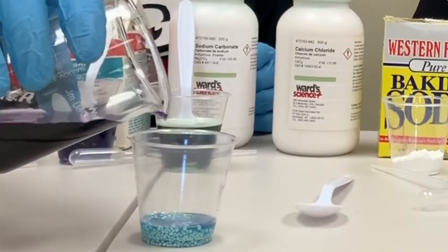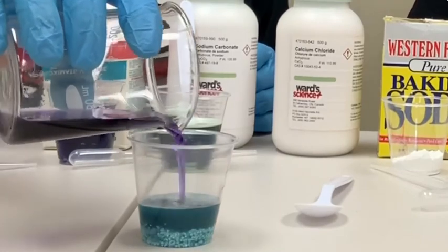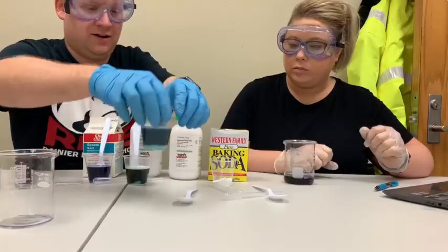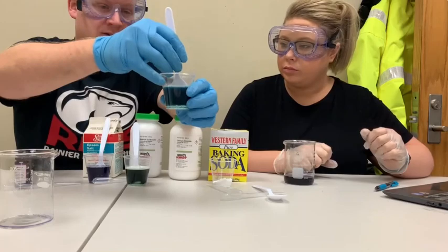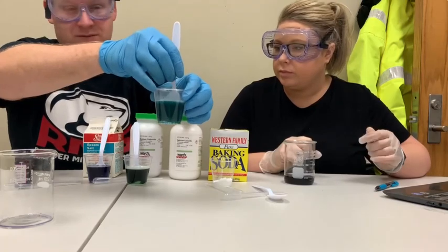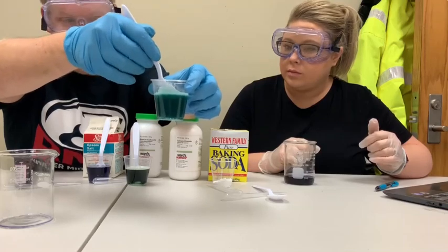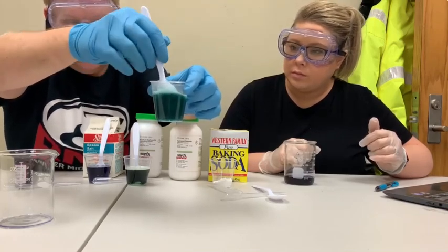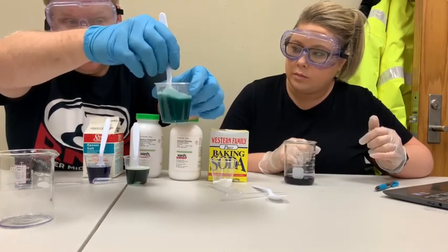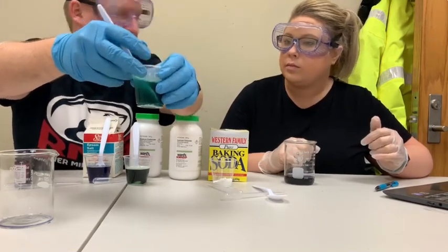Oh, do you notice that color change there? Yep, it's turning a little more blue. Yeah, blue, and as it sits there, it's almost a bit of a green tint as well. It's weird to start with that purple color and then have it change. Why don't you feel this? Did it get warmer or colder? Oh, definitely warmer. This one definitely got warmer as well. And as I look closely here, I don't see any gas being produced. At the bottom, I don't see any precipitate. What's left at the bottom is still our calcium chloride. But that one definitely got warm, which is kind of nice because we have the windows open.